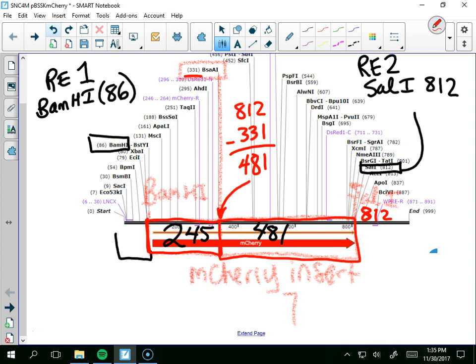From here to here. What was your question? Sorry? Yeah, like you could have got that if you went 726 minus 245. That would work too. Right? It has to. And that's a double check you can do. I recommend it. In fact. Okay. All right. So our fragment then in our mind's eye is a fragment that goes B to S from start to finish. And yeah, we got a little B in there. Okay? So I just want to keep that in the back of my head when I'm doing my inserting.